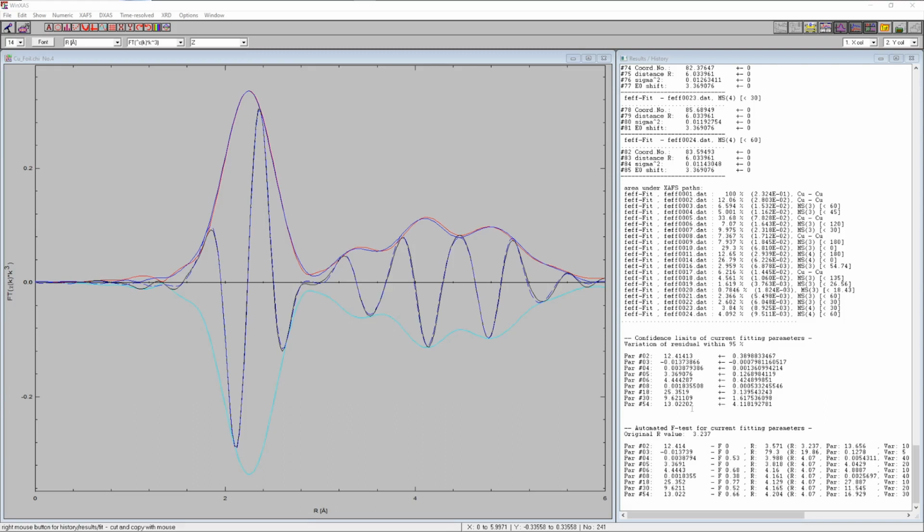In the refinement, this is as far as we can go with reducing the parameters while still maintaining some meaningful structural information, when we transfer this approach to the analysis of the copper clusters.